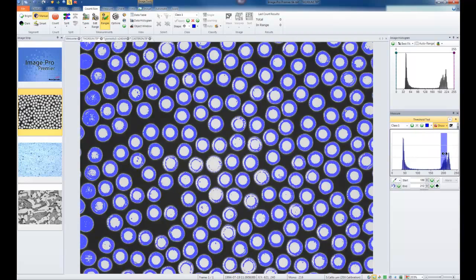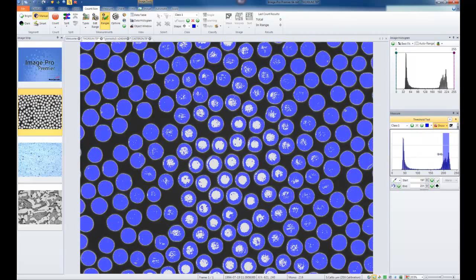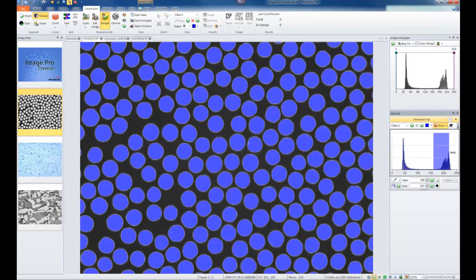Now once I put my selection over the correct intensities, it's important to note that the range that I am selecting is based upon a range of intensities. 0 is dark, 255 in an 8-bit image is white. So by selecting the ranges on the right-hand side, I'm selecting the brightest objects. For different bit depth images, this range will change.